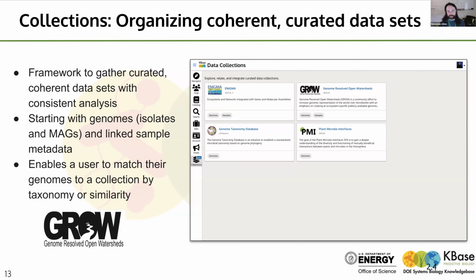And another way that we're serving up public data is with this new feature called collections. So collections is a new data environment that we just recently released earlier this year. And you can see that we've got a couple of projects that we have worked with as the initial set of collections that we've released.